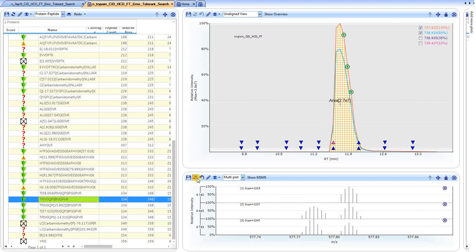And I can expand this out, and I can very quickly see across the entire full scan mass spectrum the +2 charge state, and I can begin to zoom in across 3 different scans to evaluate the isotopic distribution, as well as get an estimate of the mass error. The triangle represents the centered mass or theoretical mass, and you can see where the distribution is, and of course anywhere that I drag my cursor will give me the mass deviation.